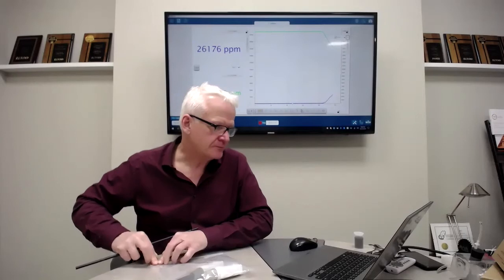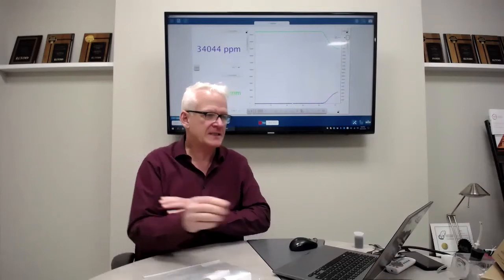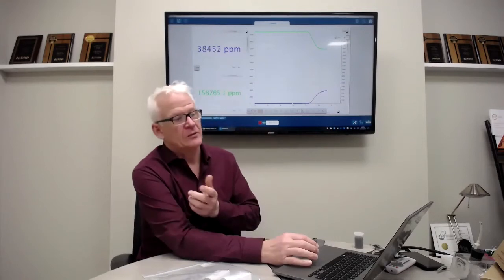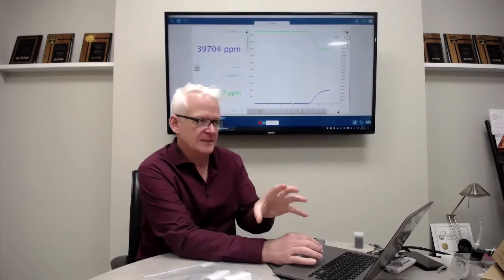Now what's interesting is they're on similar scales, the oxygen and the CO2. I think this is quite fascinating, and something I wasn't entirely sure I'd see, but this really does display it quite well.